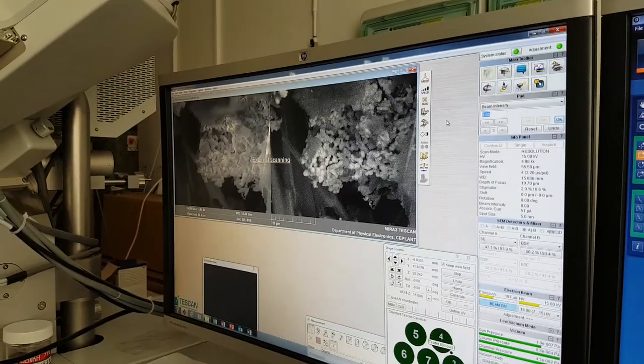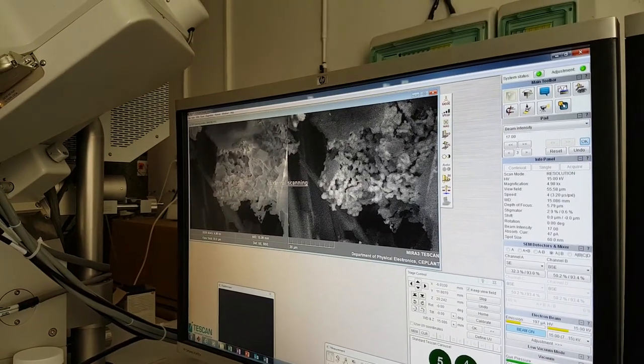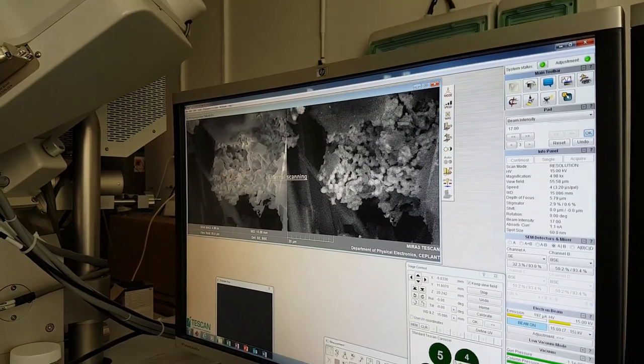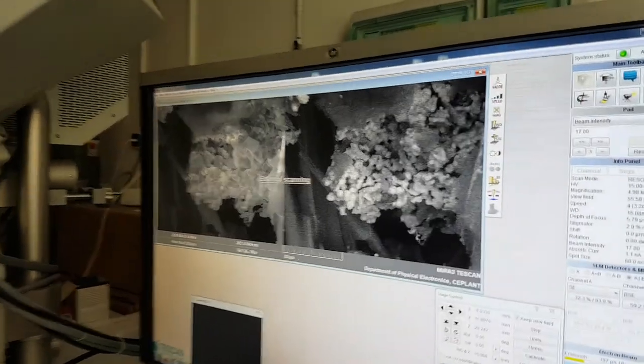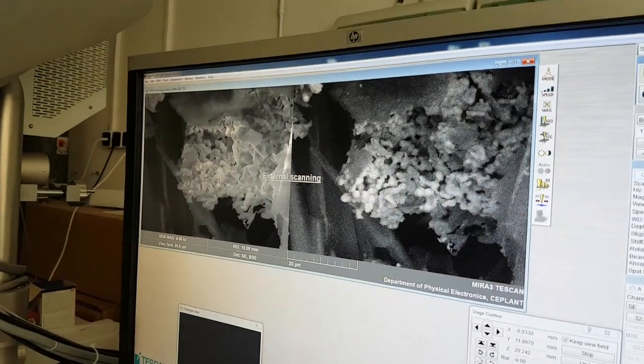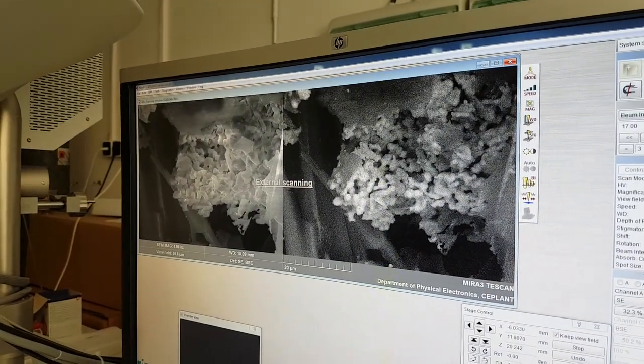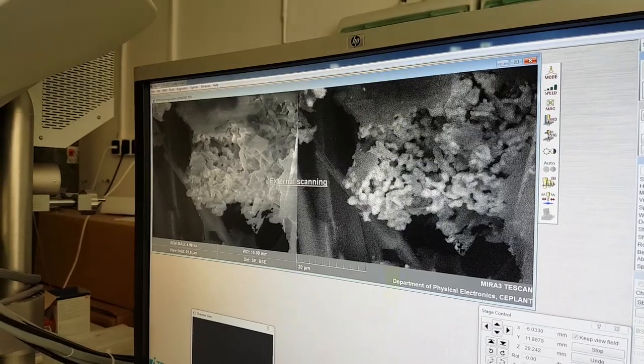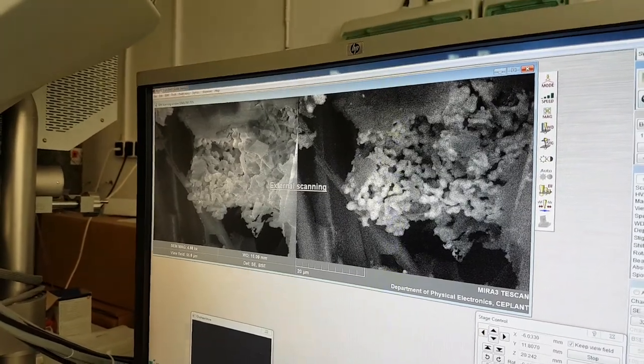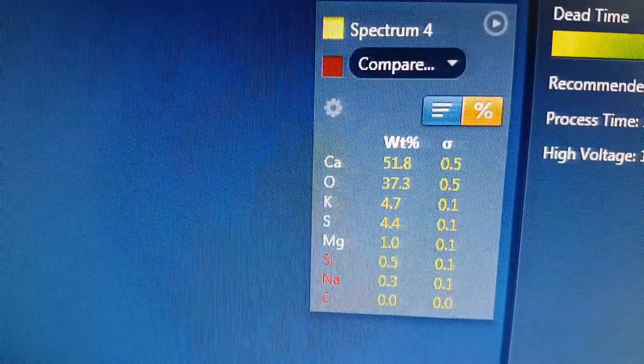Looking at the residue after I try to magnetically extract things to see what various things are in the other sample. It's the same sample but I just try to extract the magnetic particles and this is the non-magnetic particles. What do we have?